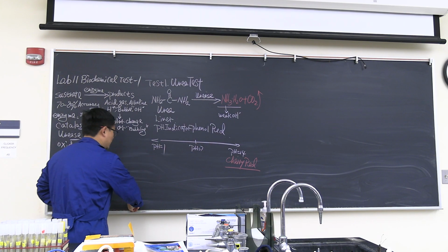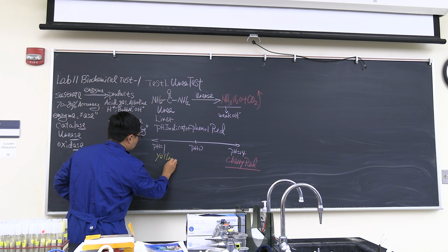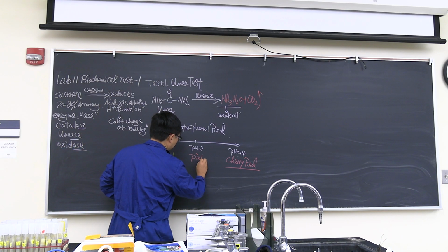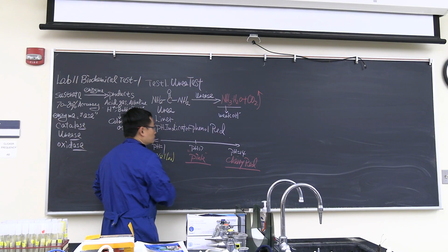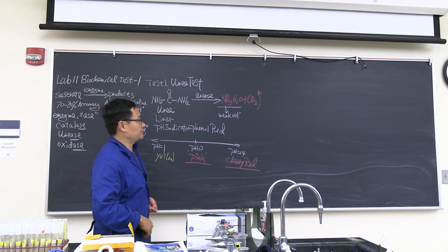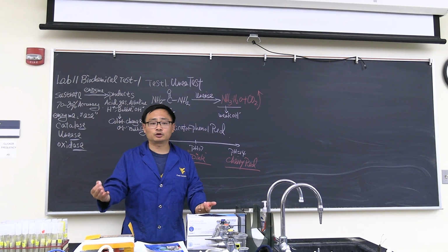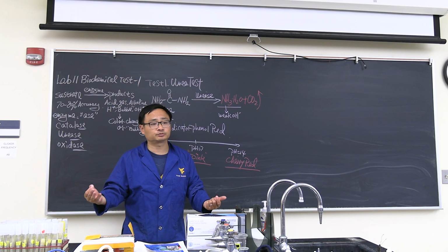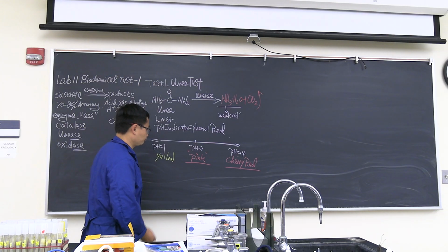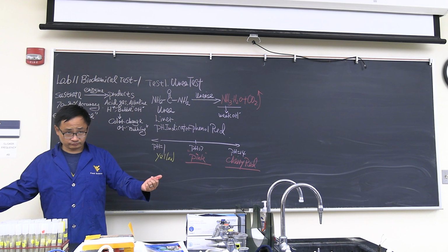And how about pH at 1? And in the acid environment, it is yellow. And the pH 7, it is original color pinkish. So what this means? You are inoculated bacteria there. After incubation, and we'll just put on your tray, okay? We incubate room temperature for 2 days. If you see the color change, become cherry red, then it's positive.